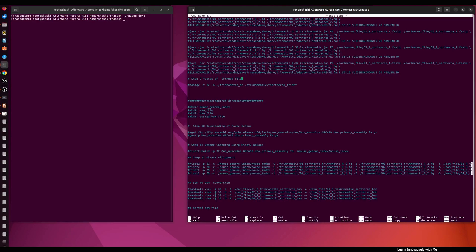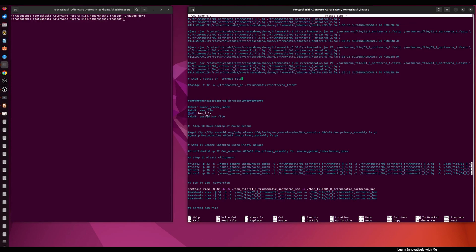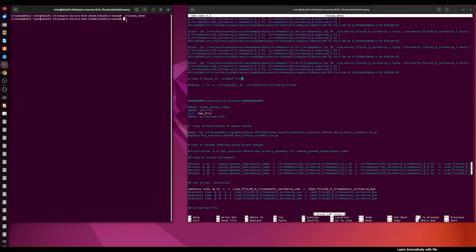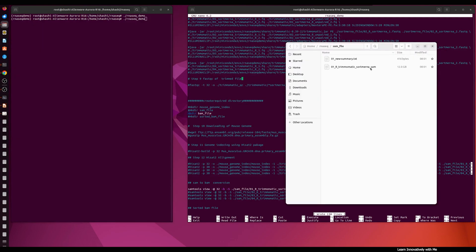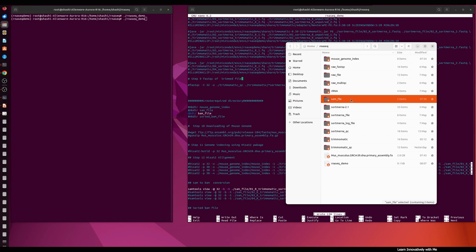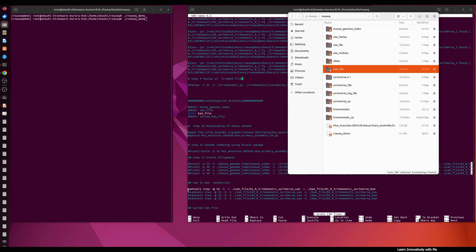I have already written the command for SAM to BAM conversion. I'm going to activate it in the script. The command is: samtools view -@ 32 (thread value), then the input SAM file created by HISAT2, and -o for the output BAM file saved in the BAM file directory. We need to create the BAM file directory first with mkdir bam_file. I'm going to save the script and run it for SAM to BAM conversion.